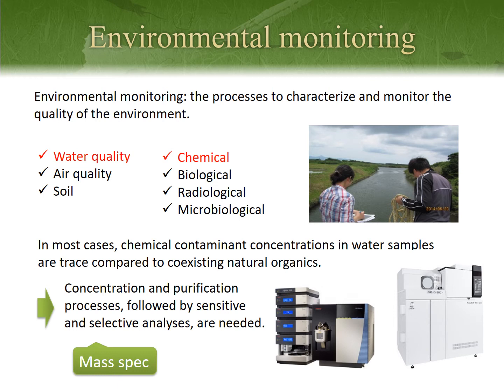In most cases, chemical contaminant concentrations in water samples are trace compared to coexisting natural organics. So concentration and purification processes followed by sensitive and selective analyses like mass spec are needed.